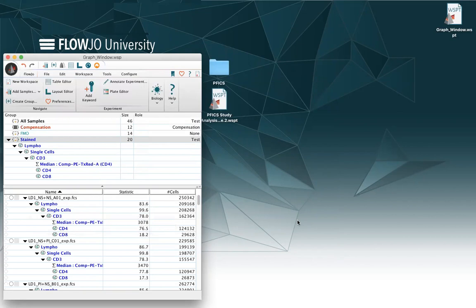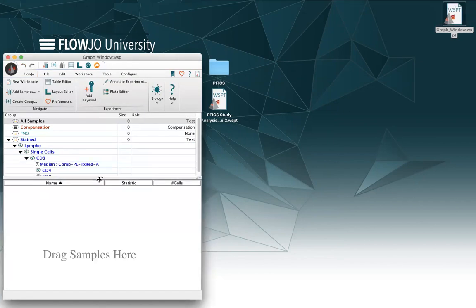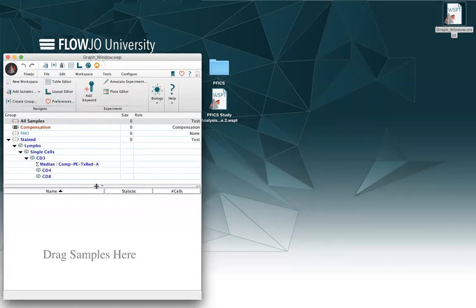So now I have my template saved on my desktop, and if I open it up, I will see that there are no FCS files in it, but there is a gating strategy saved, as well as for the layout and the table editor.